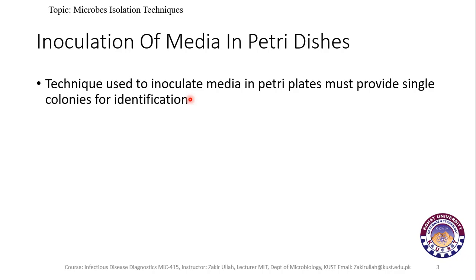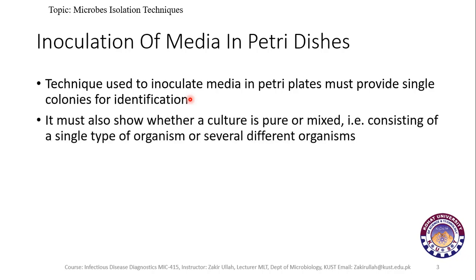So single, isolated colonies are important for this examination, and it must also show whether a culture is pure or mixed.